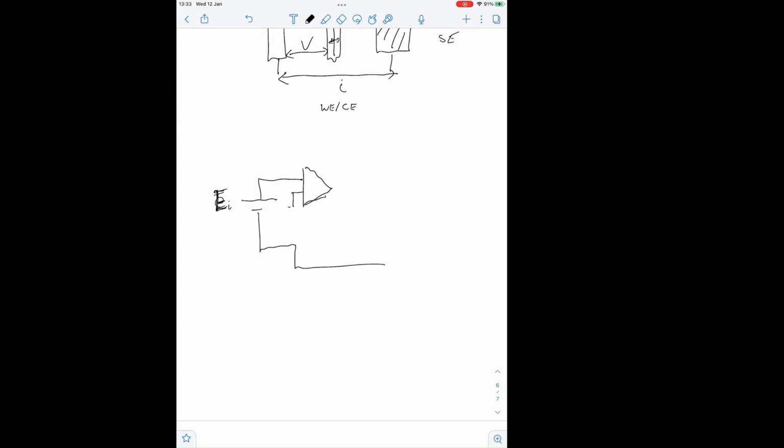And we ground one side of that, and that's the minus and the plus of the amplifier. And this comes out, and this goes, so here is our working system, our cell, and this is the reference electrode, and no current will be drawn up this arm.